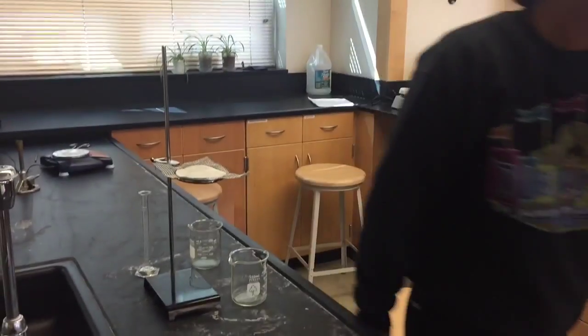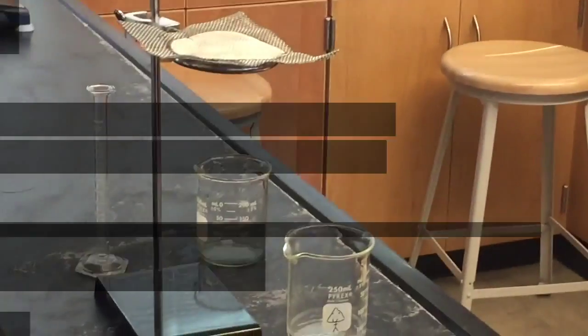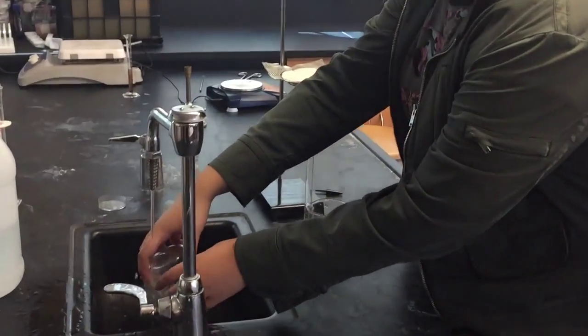Always wash the labware at the end of the lab. This is a beaker. Its purpose is to hold or heat chemicals which you need easy access to.